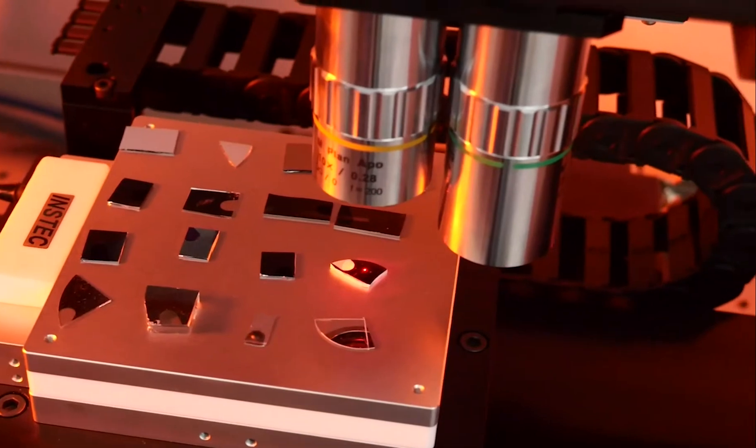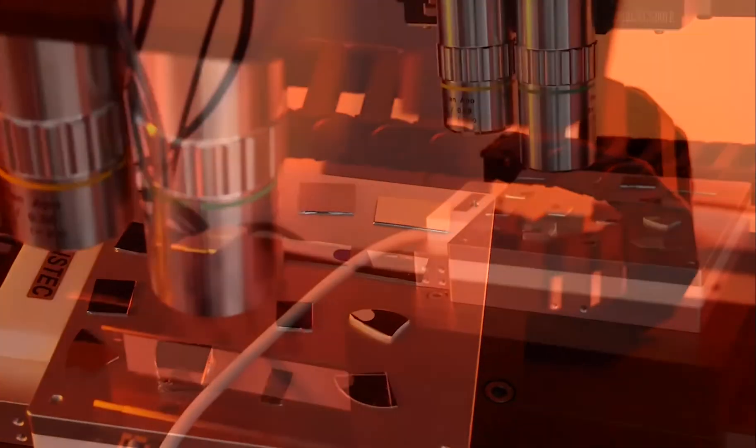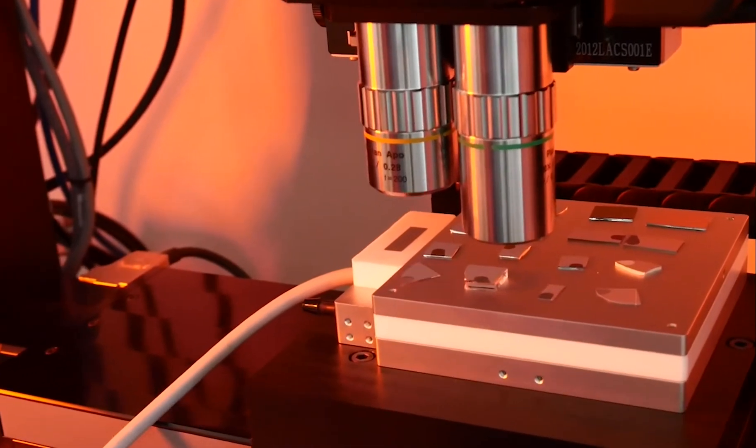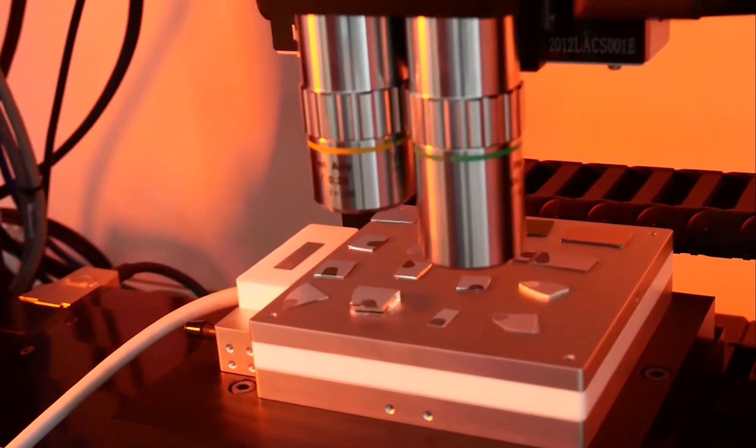We are measuring bulk silica, silicon, and sapphire, as well as a 400 nanometer thick thin film dielectric on silicon, using our automated high throughput testing routine.